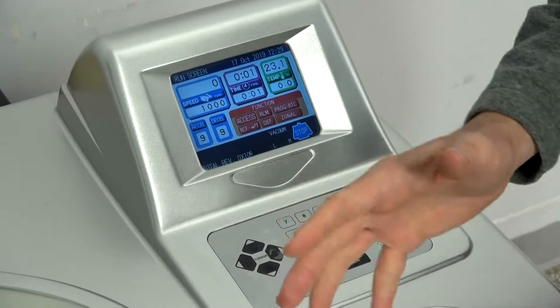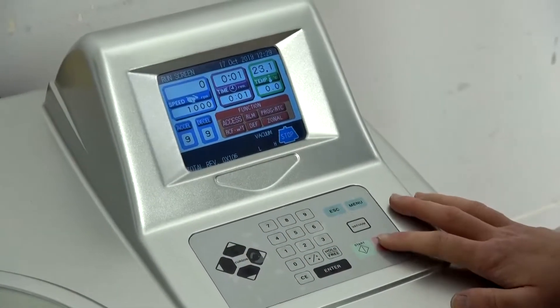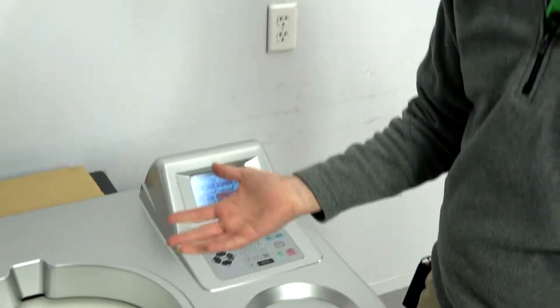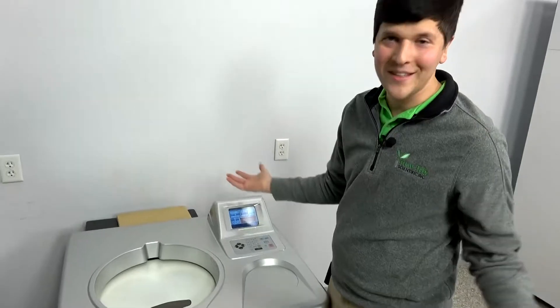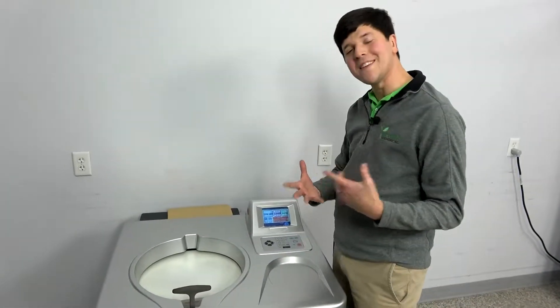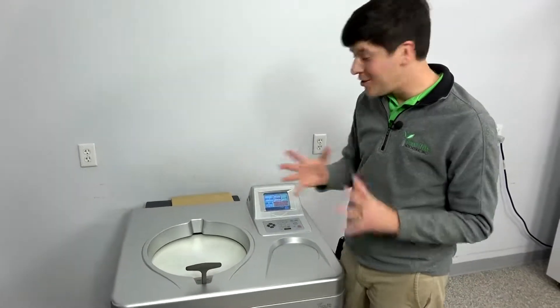As far as software features, you've got a rotor life management tool built in. You have automatic RCF, so if you don't feel like doing the math, you can skip it. And there's a scheduling feature, which allows you to decide when people can use this centrifuge.